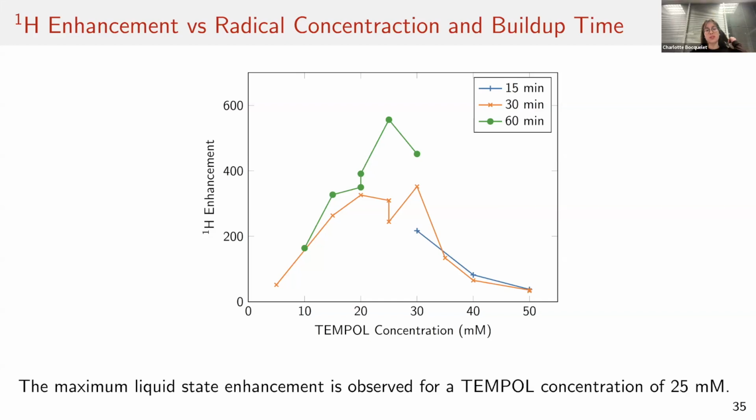There is a question from Jeffrey Bodenhausen. So after dissolution, the concentrations of TEMPO are much higher in bullet experiments than in traditional liquid state dissolution DNP, because the dilution is, say, 1/10 in the former case and 1/100 in the latter. Okay, so that was not a question, that was, I think, a remark. Yeah. Thank you, Jeffrey, for the remark.